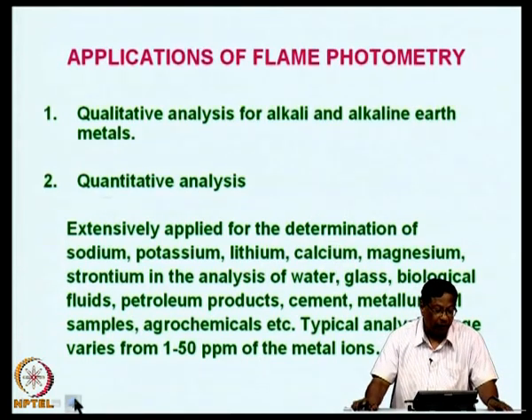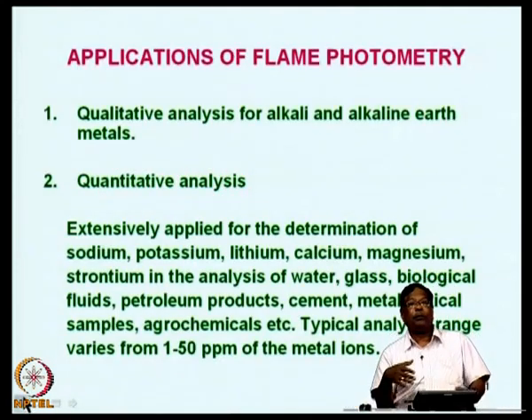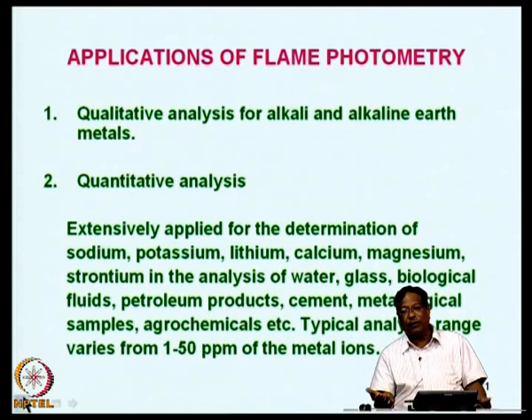Now, you can always say that there is no fixed limit for the determination of these metals. You can make your calibration curve using 1 to 5 ppm of sodium also, or you can make your calibration curve 1 to 50 ppm also, depending upon your system.